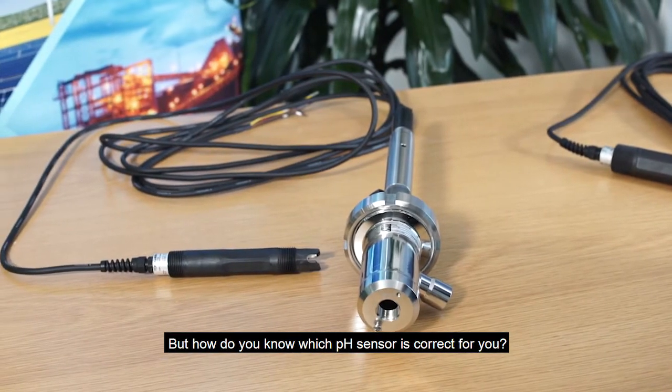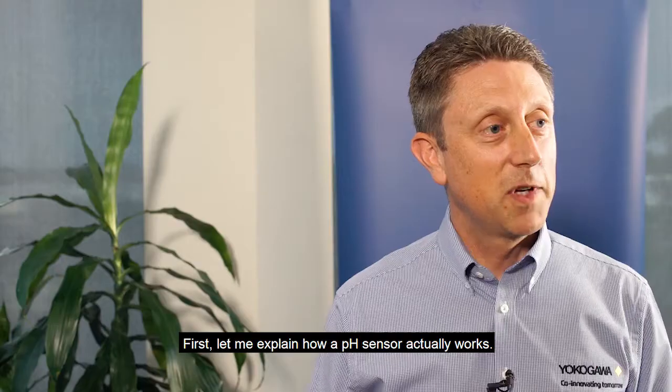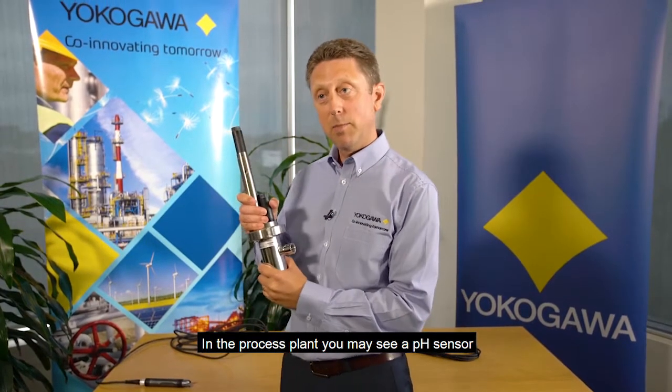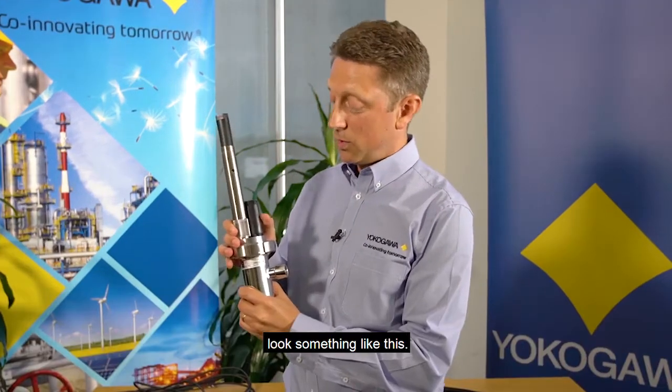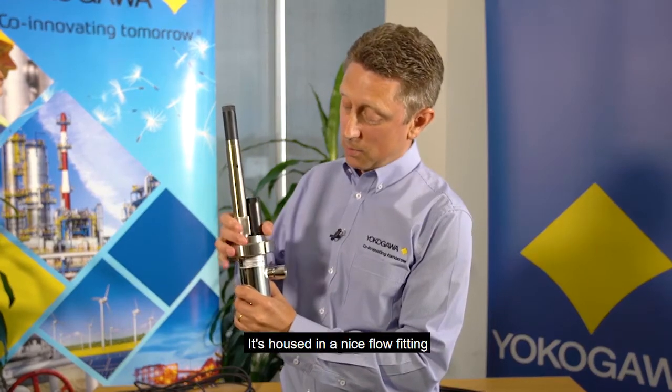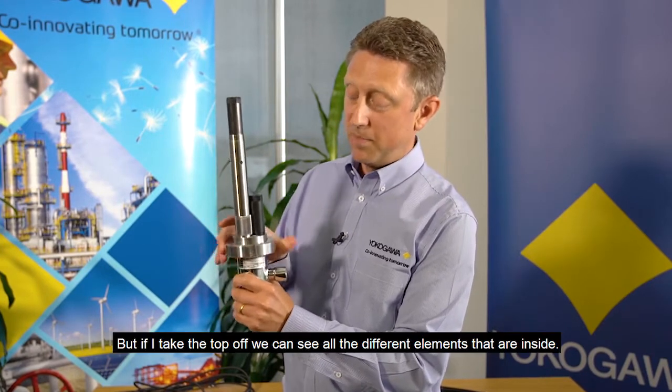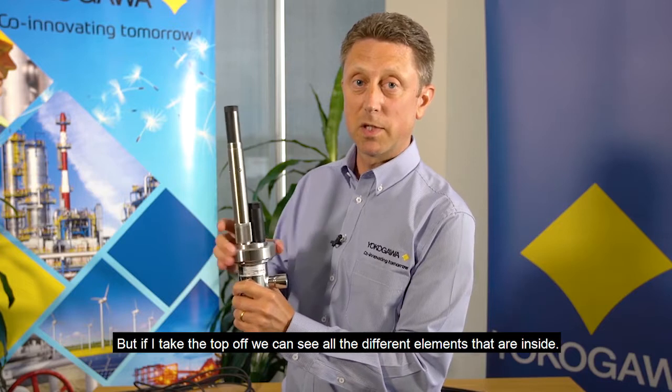But how do you know which pH sensor is correct for you? First, let me explain how a pH sensor actually works. In the process plant, you may see a pH sensor look something like this. It's housed in a nice flow fitting to allow the process to pass past it. But if I take the top off, we can see all the different elements that are inside.